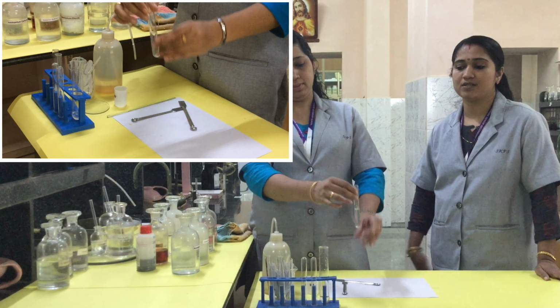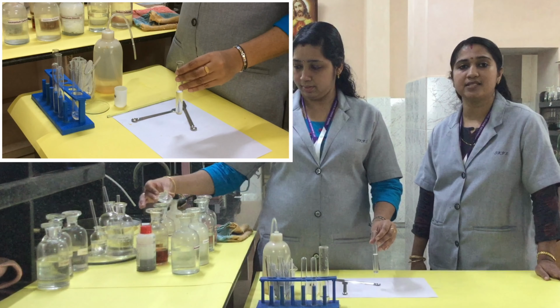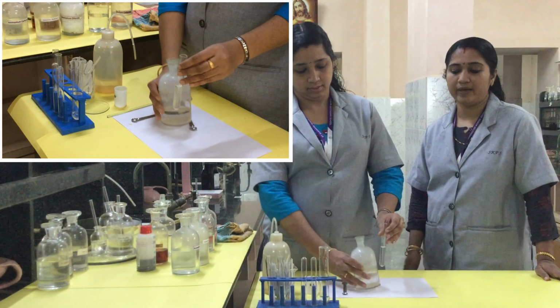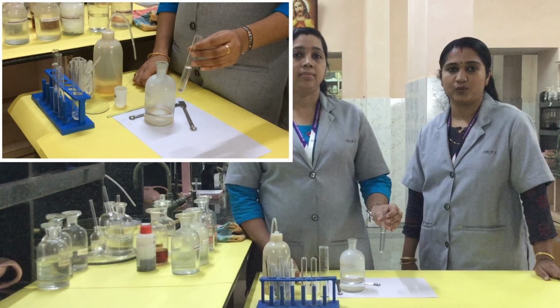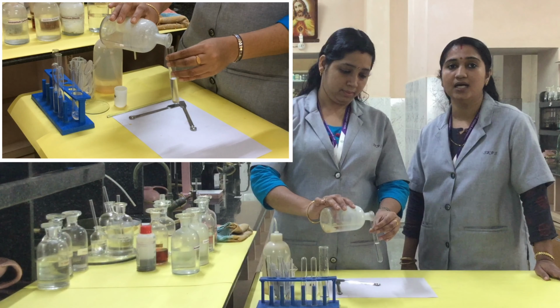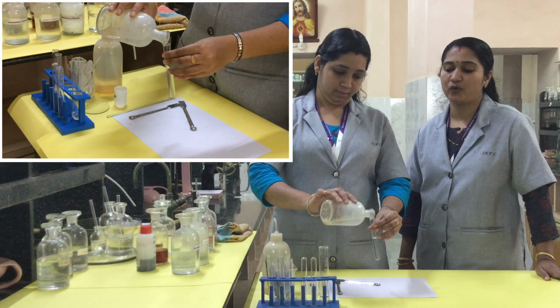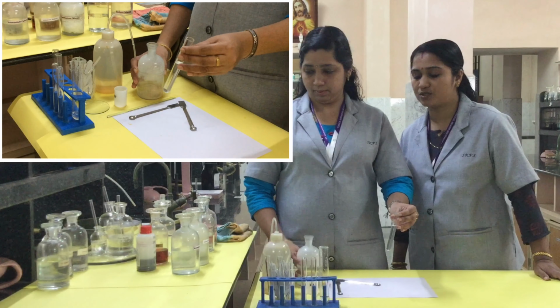Now we want to test for the group 4 analysis. The group reagent that we are using is ammonium chloride and ammonium hydroxide. To the salt solution, we can add H2S, that is, hydrogen sulfide gas is passed through the solution. We want to check the presence of the group 4 cation, that is zinc. Just add H2S to the solution.